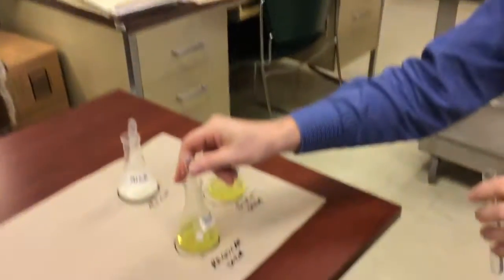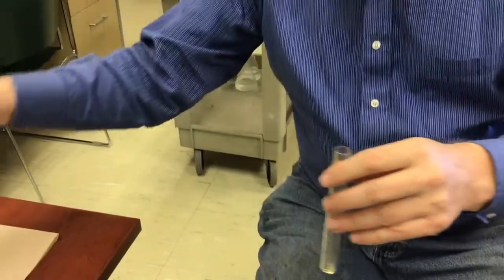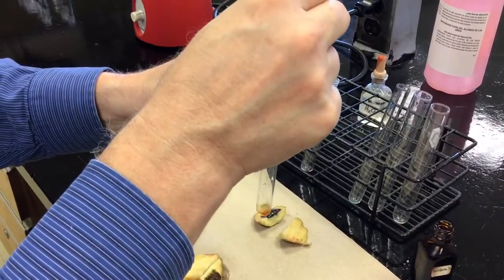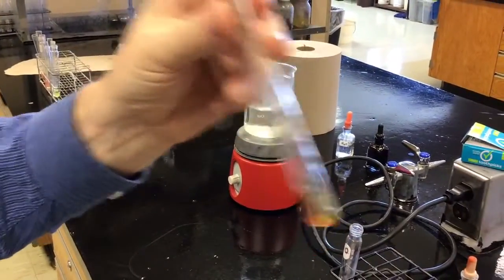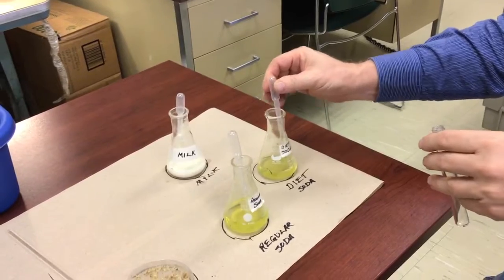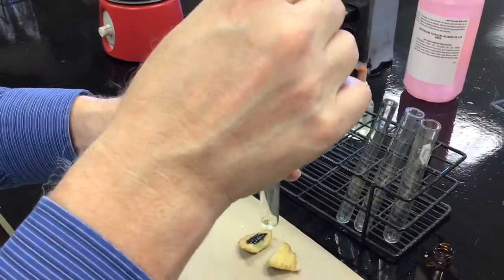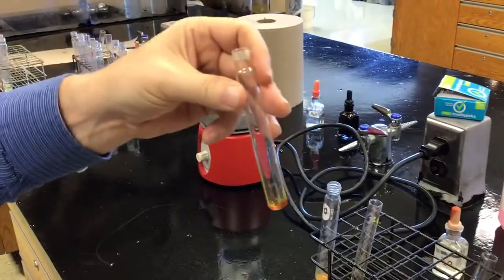Set up the regular soda. 1, 2, 3, 4, 5, 6. 2 drops of Lugol's into that. 1, 2. Kind of pretty. Pretty is not a scientific result, although it's something you often get. And the diet soda. 2 drops of Lugol's into the diet soda. 1, 2. A very similar pretty.